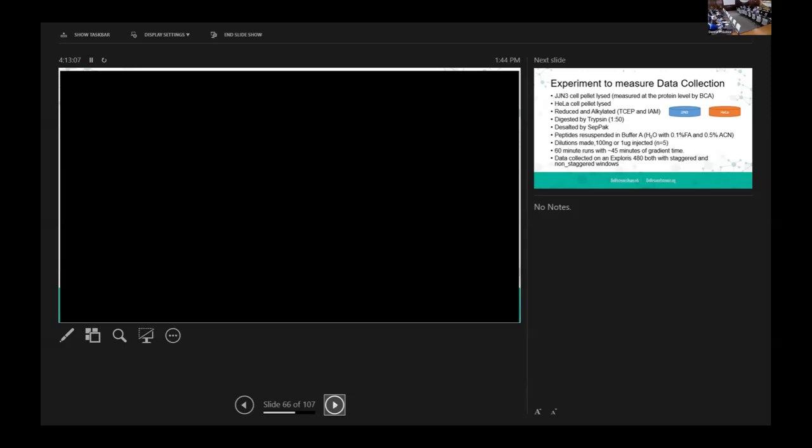Yeah, ultimately, it's the researcher's decision how to do the experiment. You can advise all you want, but you can't make them do something. We have people that say, okay, we'd get better data doing DIA for this, but we want to do DDA because we're comfortable with it. We want to run a gel and do DDA because we've done it for 10 years and we understand the data, knowing that it's going to be better if we do DIA. We had planned on shutting down an instrument that was only doing GELC, 3 or 4 years ago, and it stays busy because of the legacy people that don't want to change.